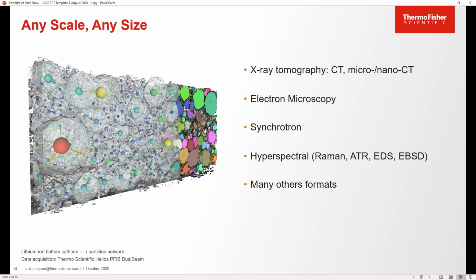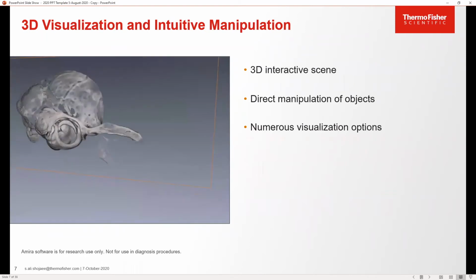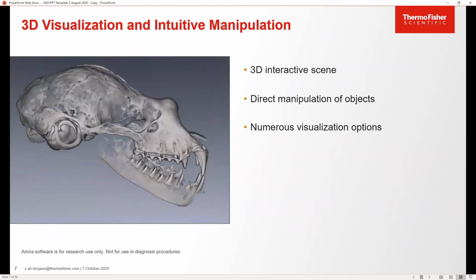As long as it's an image, there is a way to bring it into Avizo. Obviously, in most cases, you don't even notice it's a step because the more common imaging modalities are either in TIFF or JPEG or some other pretty standard format that Avizo and Amira can just read directly. The next step is going to be visualizing your data.